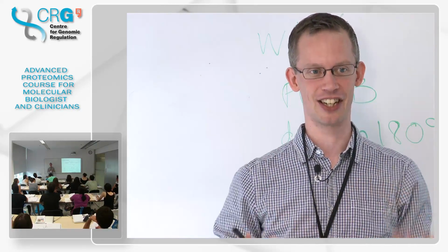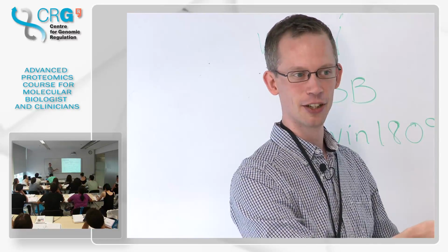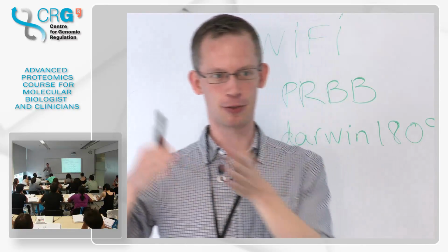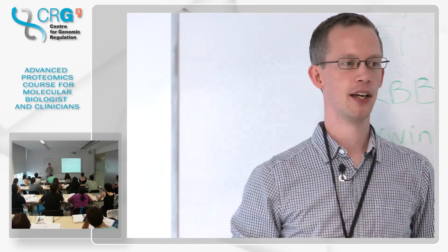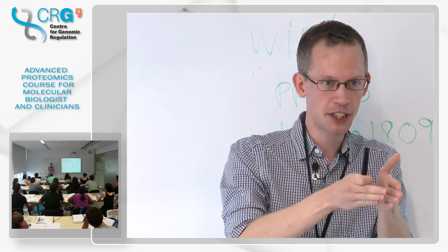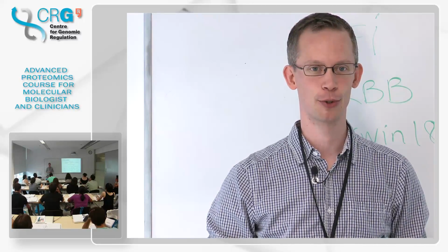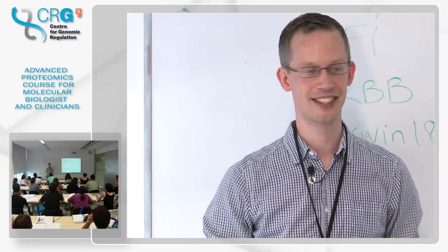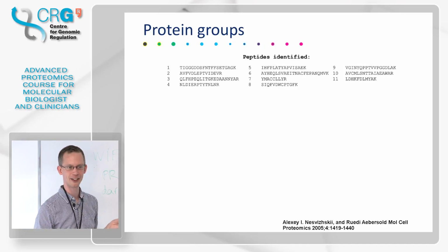Essentially, to see how confident I can be. Maybe for the biological context here, it would be enough to know that it's alpha tubulin. But it's not enough if you want to talk about different splice isoforms, or if this was, say, different olfactory receptors or some other receptor family which may have a lot of shared peptides. Then it may be important that you know this can be this particular receptor only, or this group of receptors. But that's the downside of all this cutting into pieces that we love to do in bottom-up shotgun proteomics. That's the downside of the technology, that you end up with this problem. Okay, I hope you got this, because it gets a bit more complicated on the next slides.